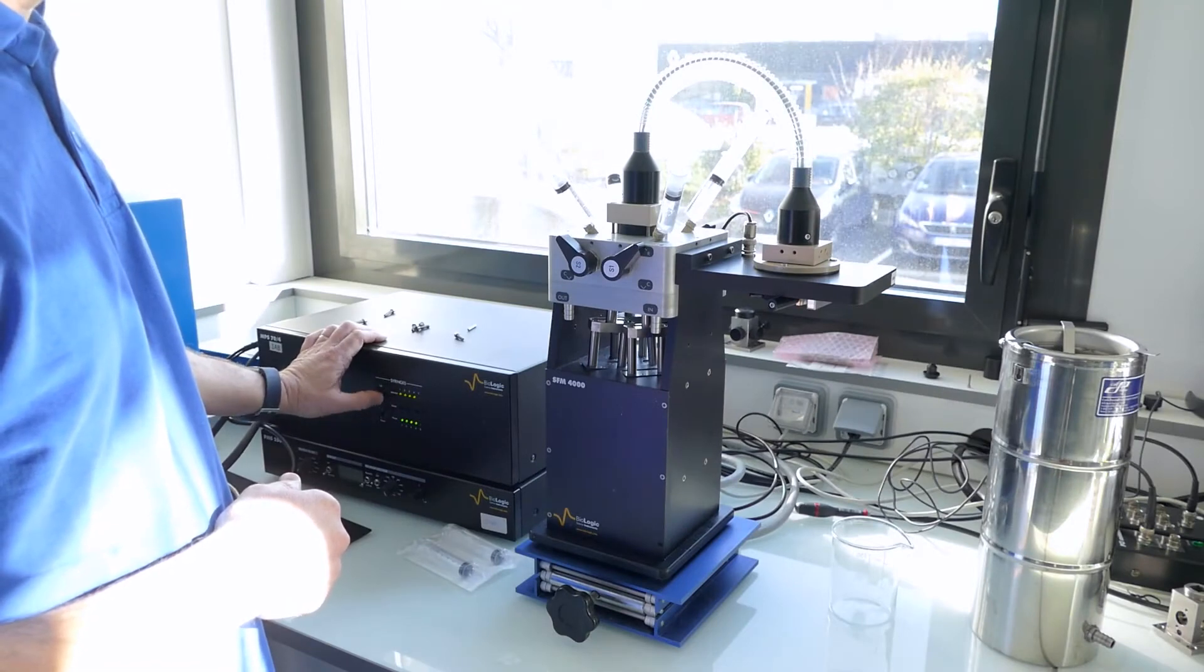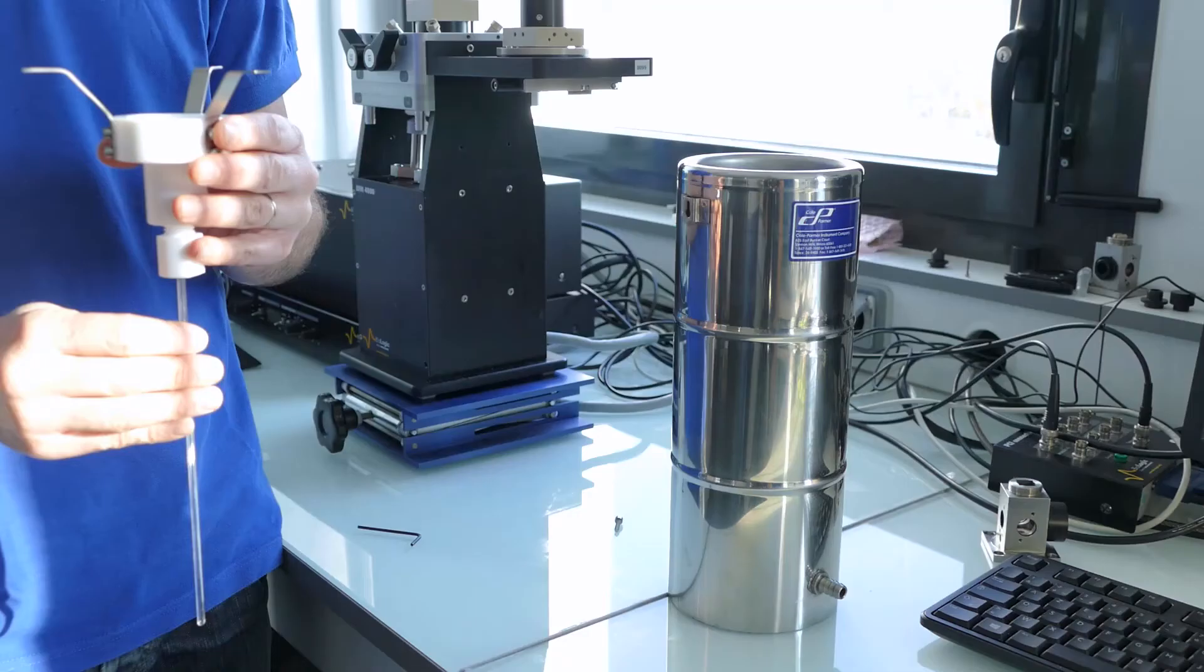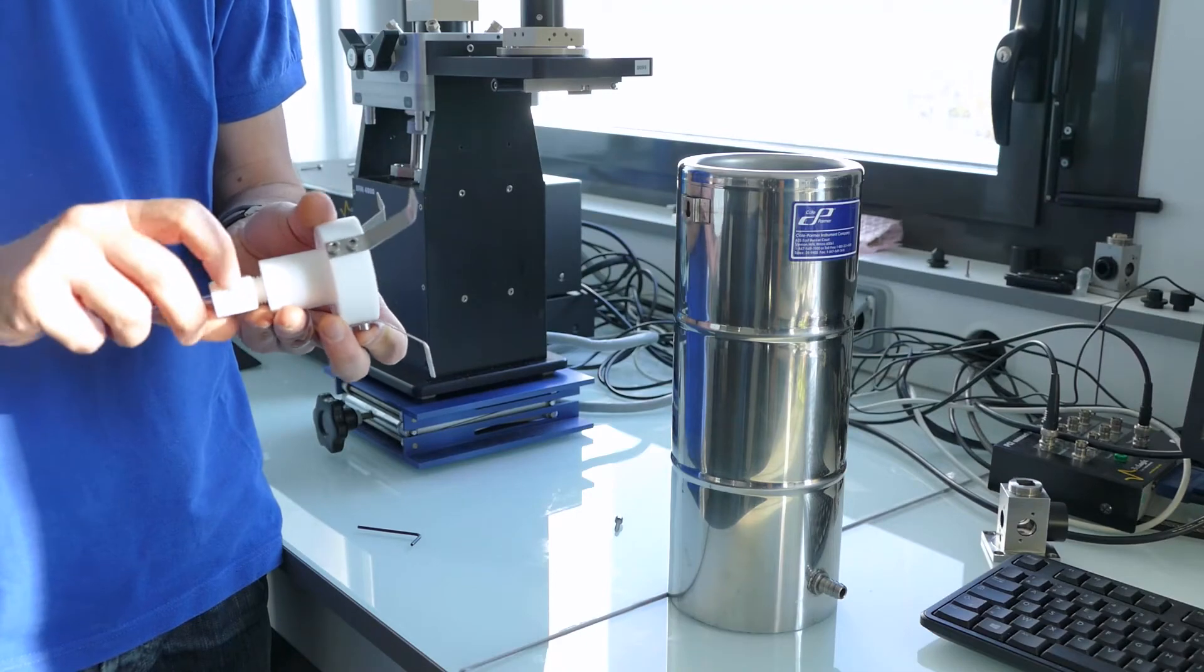Load solution in the SFM and remove air from the internal tubing. Install the EPR tube on the packing funnel.